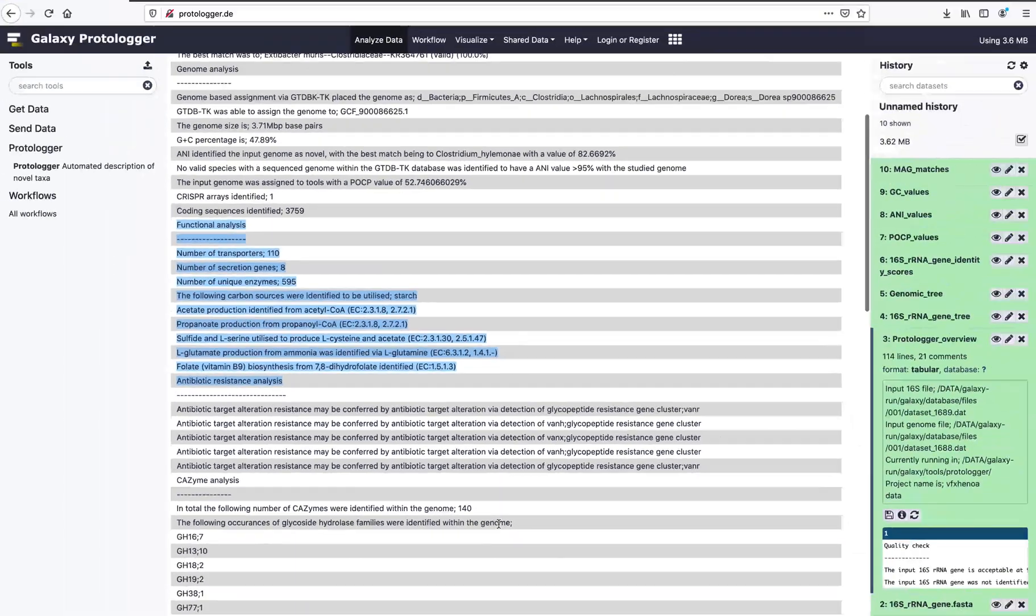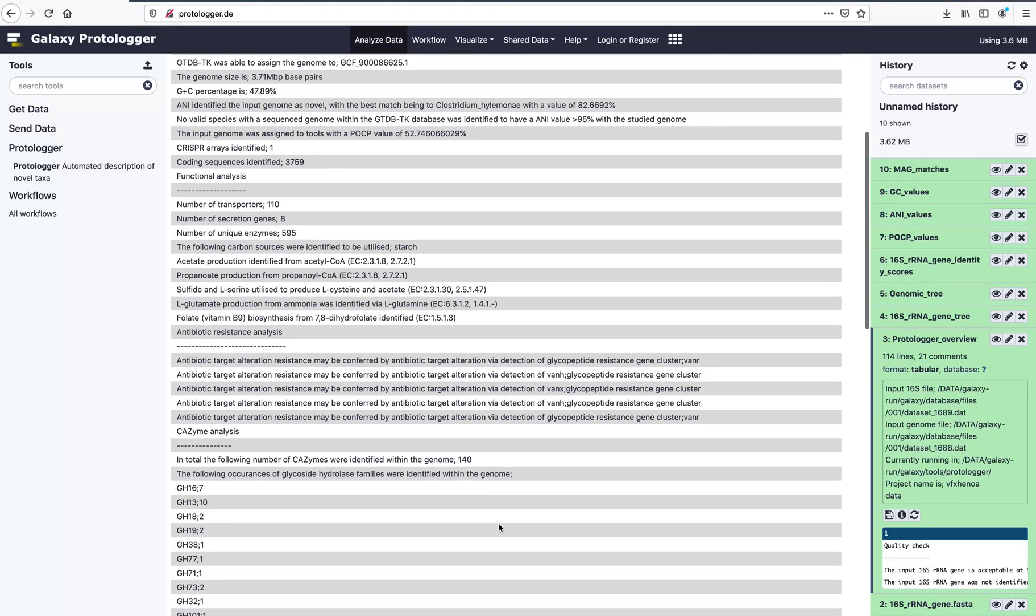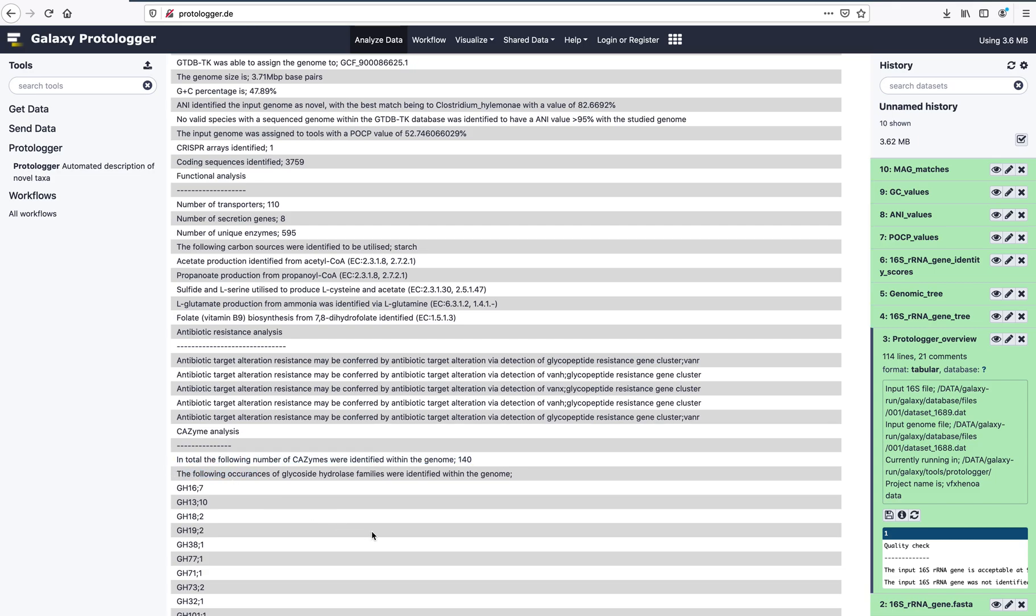By annotating against the CAZY database, Protologa can tell you the number of CAZymes present within your genome and gives a detailed breakdown below.